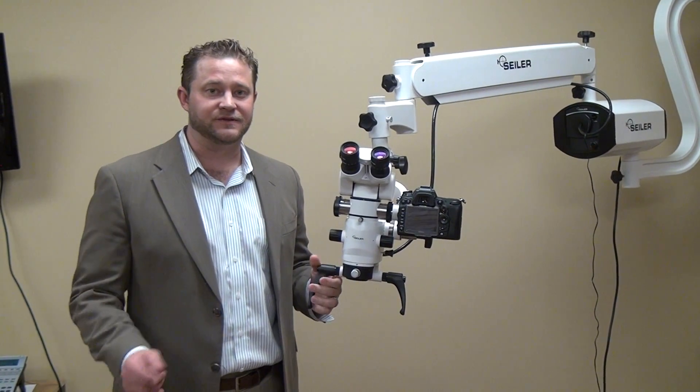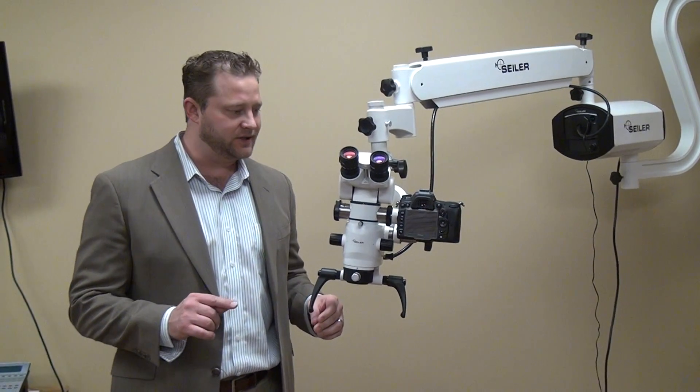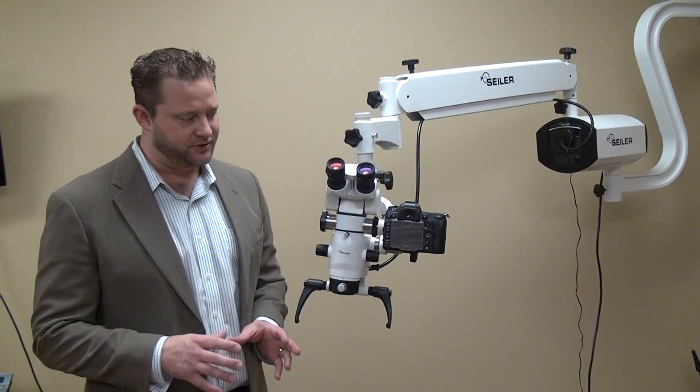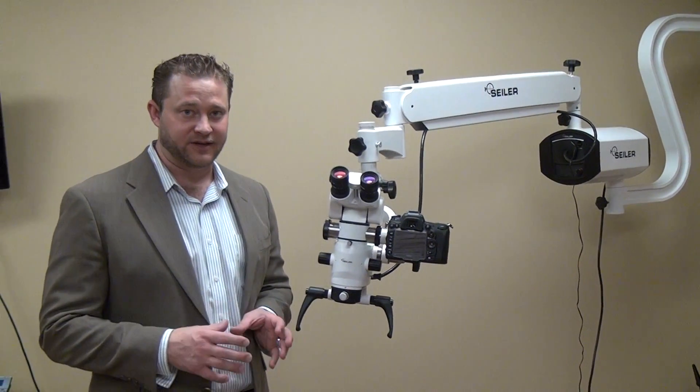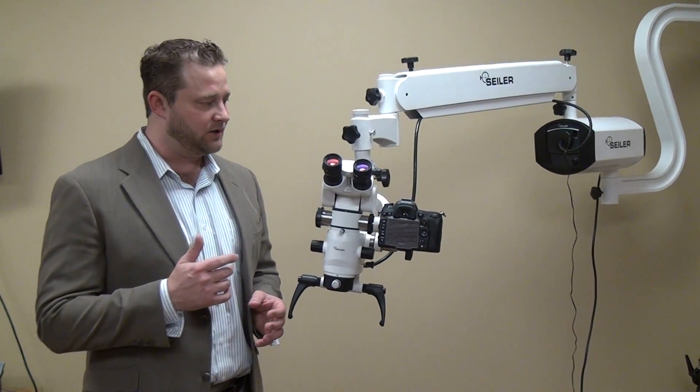Hi, I'm Dane Carlson, Division Manager of Seiler Microscopes based in St. Louis, Missouri. What I wanted to show you today was just to make sure that you understand with a DSLR camera some of the advantages of using it on your microscope.